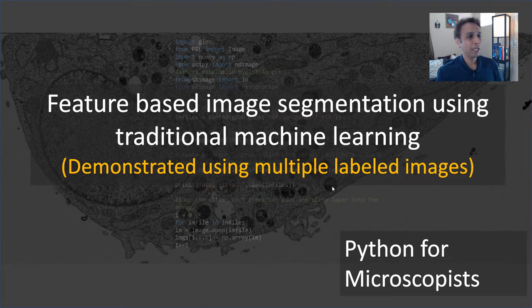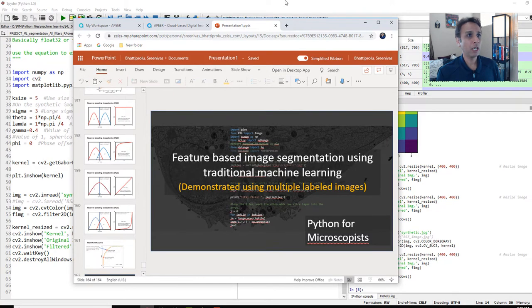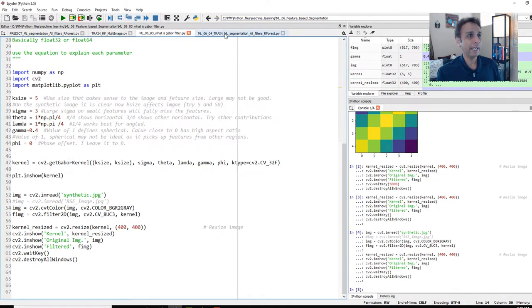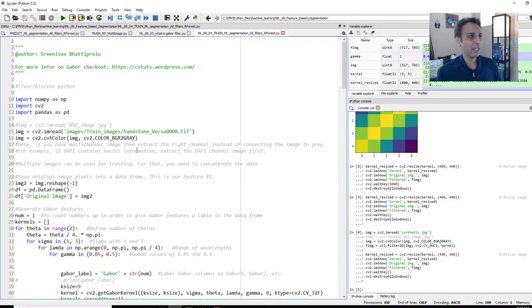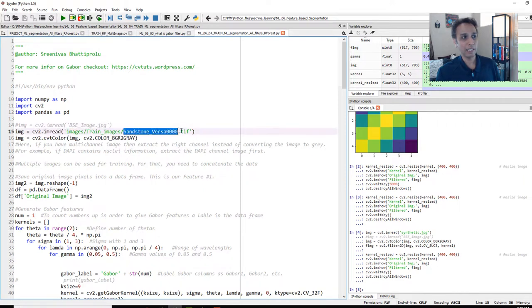Let me jump in to show one quick thing. In the last video, watch those videos about traditional machine learning. For training, I used only a single image, one single image.